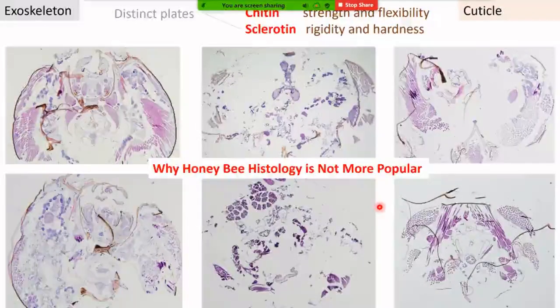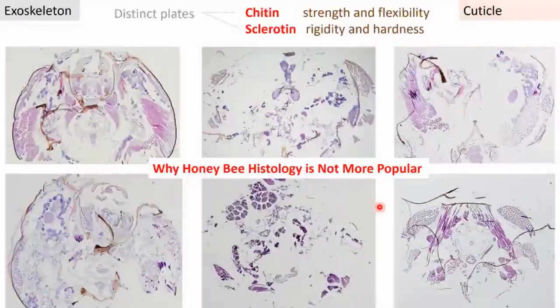And I think with the next couple of slides, we'll prove that with a little bit of patience, a good microtome, and a graduate student with some time on their hands, you can always outsmart some of the tissue preparation techniques and figure your way around some of the difficulties that we face when starting new research projects.